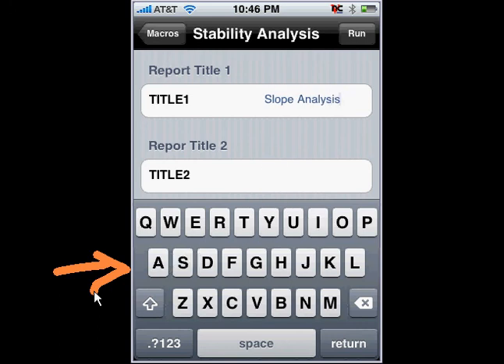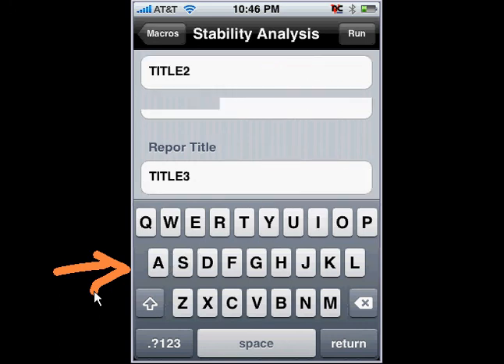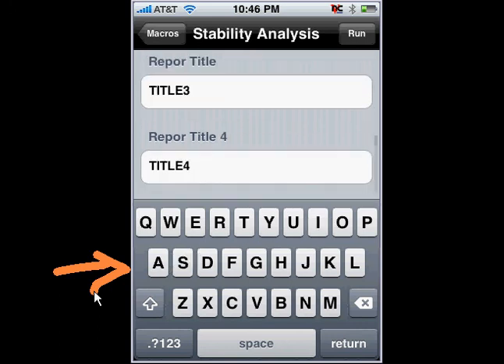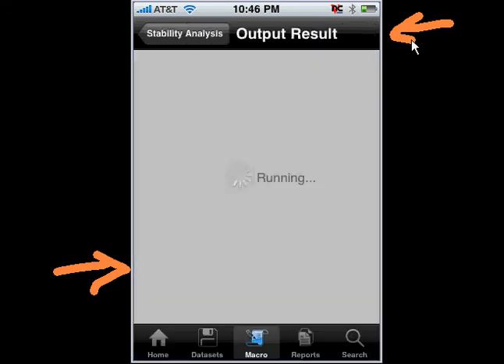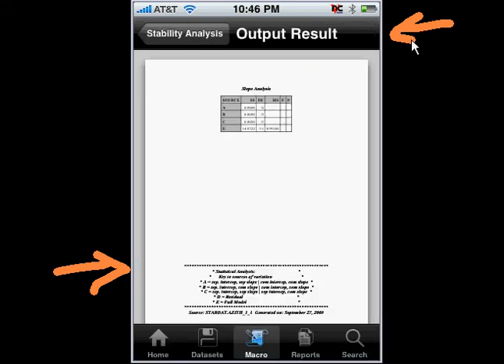You can have up to four titles, which appear at the top of the report. So if I were to run this now, it would generate a different report — upon the same data, but a different report. In this case, just the slope.